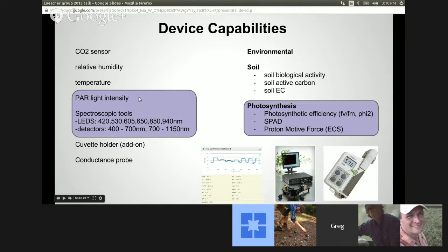And in a general sense, we have a little spec. We have 2 different detectors and a bunch of LEDs. So if you are interested in other types of measurements which use these LEDs, you could do those as well using absorbance or reflectance.